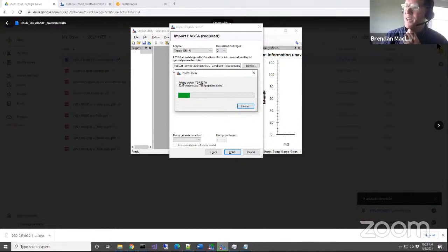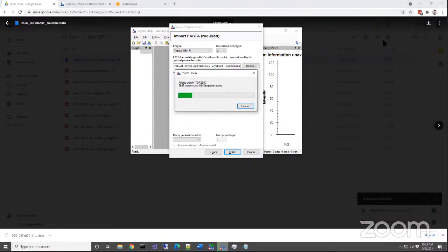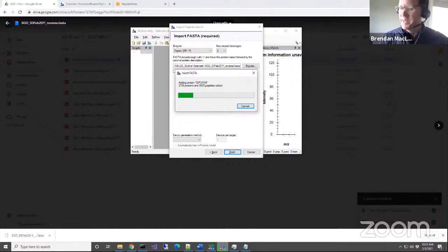Okay, well, that's going to take longer than I had anticipated, that we would be waiting minutes. And there are 10 questions in the Q&A box. So let's start answering some questions. I'm going to start at the bottom.